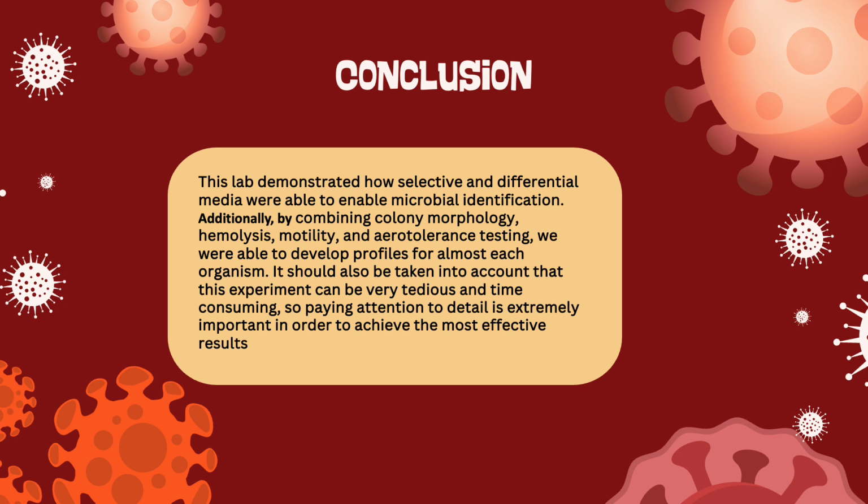So, in conclusion, this lab media experiment demonstrated how selective and differential media were able to enable microbial identification. Additionally, by combining colony morphology, hemolysis, motility, and aerotolerance testing, we were able to develop the profiles for almost each of our organisms. And additionally, it should also be taken into account that this experiment can be very tedious and also time consuming. So paying attention to detail is extremely important in order to achieve the most effective results.